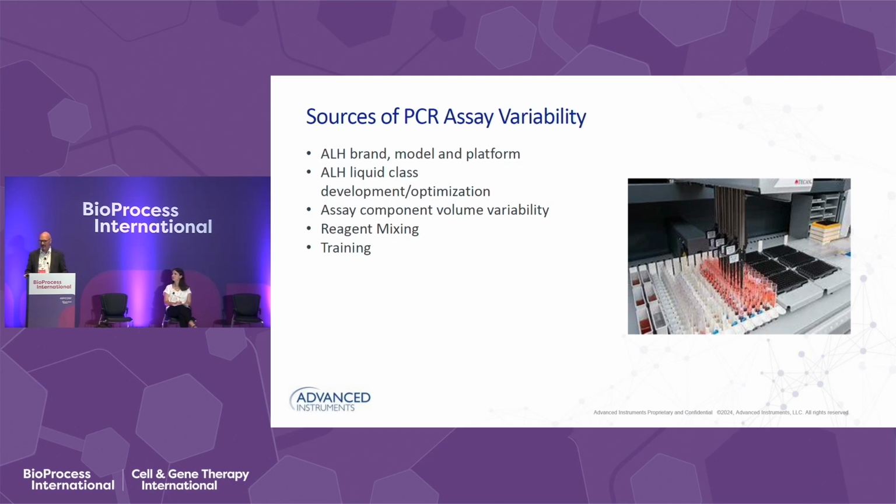that second ALH. Just because you've done it on one system doesn't mean it's going to be accurate on the next system. So using dual dye technology and a liquid class mimic, you're going to go back and re-optimize the new ALH so that you can deliver the correct volumes for your assays.